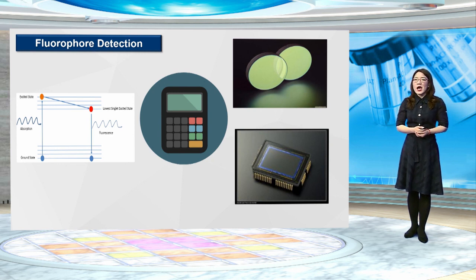Optical filters are usually used to detect the light emitted only at a particular wavelength. Signals from multiple fluors in the same sample can be recorded separately using the optical filters and the mathematical matrix. The function of the matrix is to subtract the color overlaps of the different fluorescent dyes.